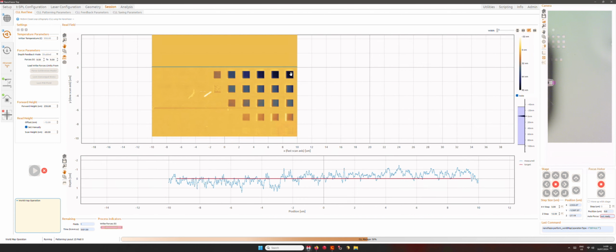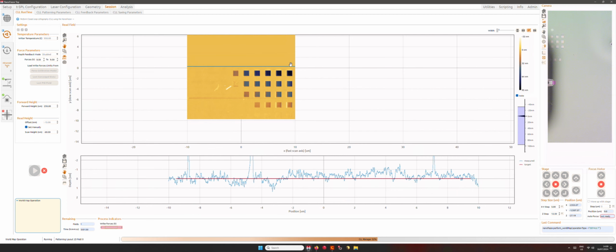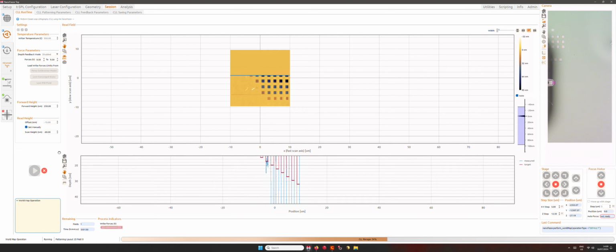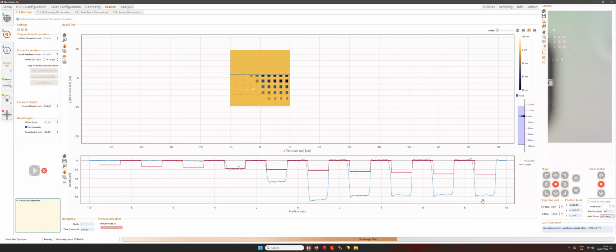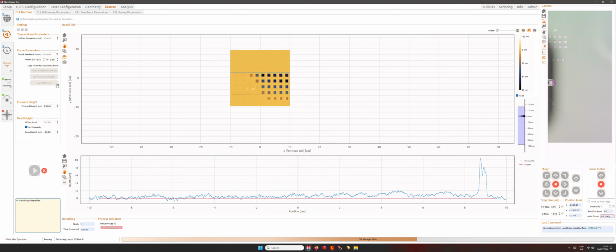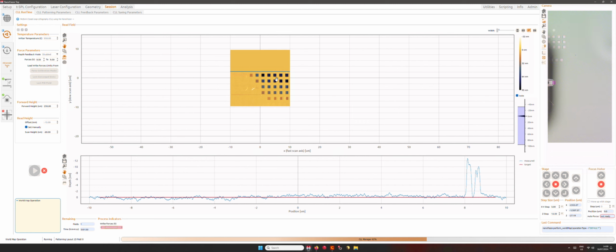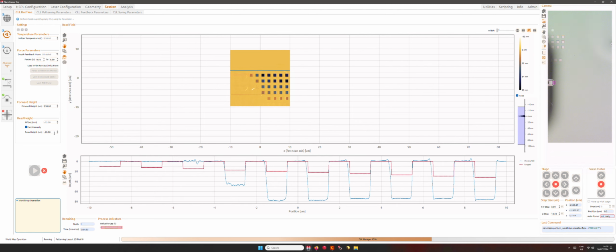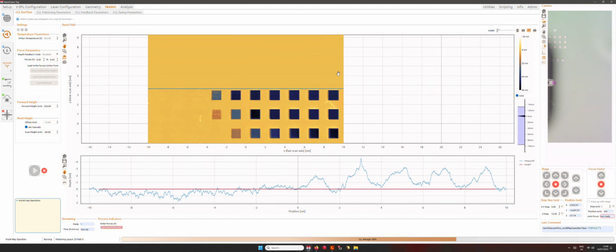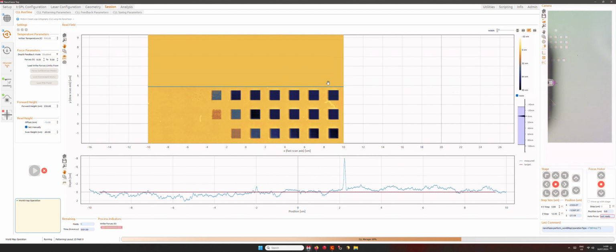In this case, we're probably already above 1000 Celsius, and we see that we are patterning. We're patterning already deeper than 70 nanometers. In this case, we're already patterning in the underlayer because we only have 30 nanometers of PPA on top. And we also set the scan height to -60, which means that probably here we're already not reaching the bottom when we're reading. So at some point we will not see much of a difference now in terms of depth.